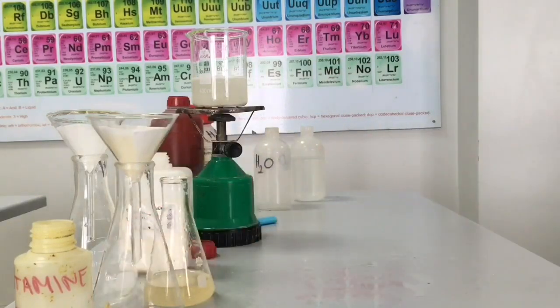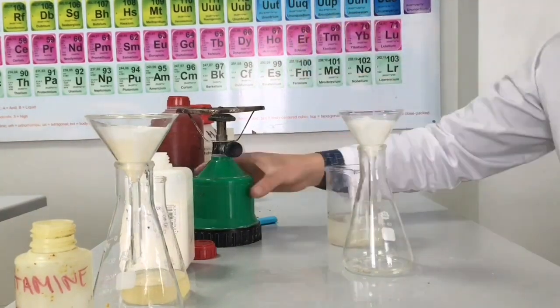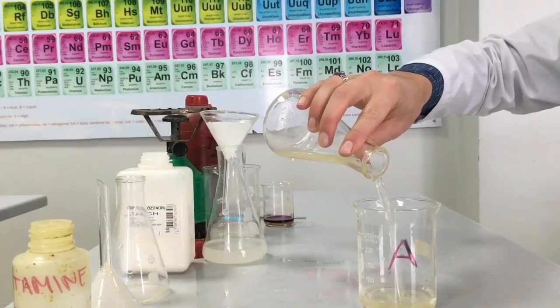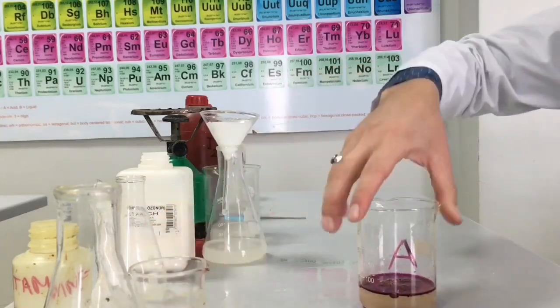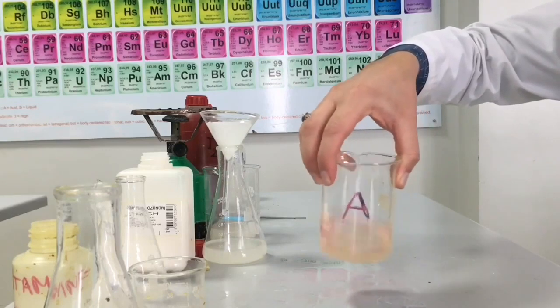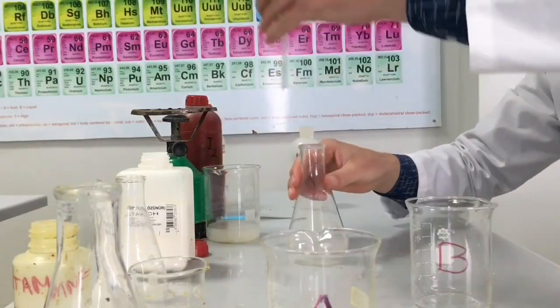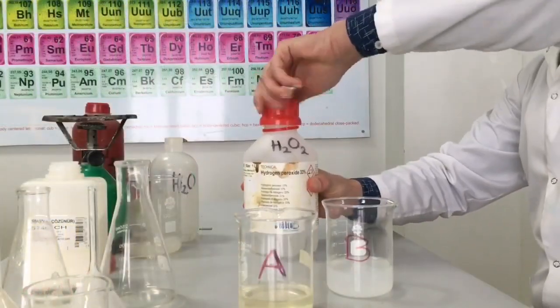We have to filter the solution of starch and the solution of vitamin C because we need a colorless solution. And now we are preparing solution A by adding the vitamin C and iodine. Solution B is prepared by adding starch solution and some quantity of 3% hydrogen peroxide.